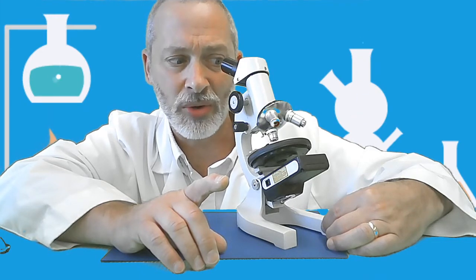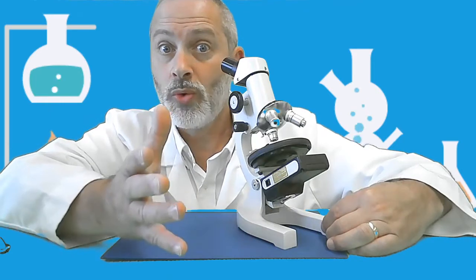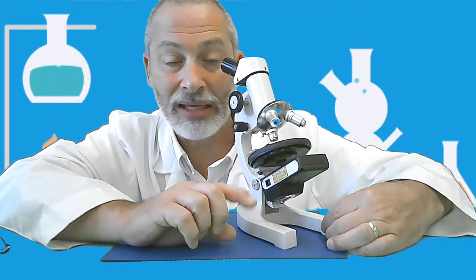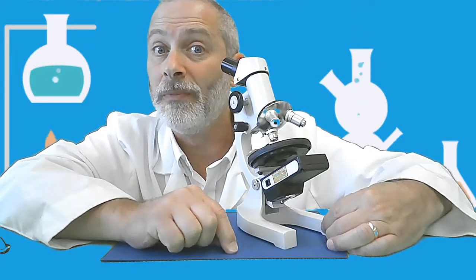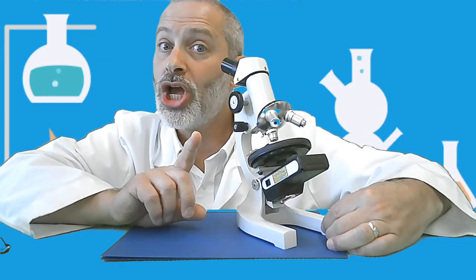And I don't see all of it, however. I just see an edge. So what do I do? Well, right now I'm looking at it and the image is all the way at the bottom of my field of view. So I want to move the image up.